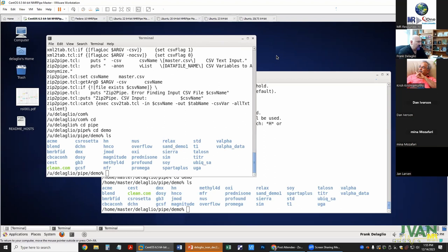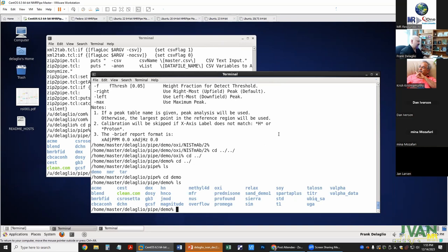Can you comment on the use of the mouse? I am a bit confused on how you use the mouse in NMRDraw. I wonder if you can give us a quick demo. Yes, thanks. We can do that.